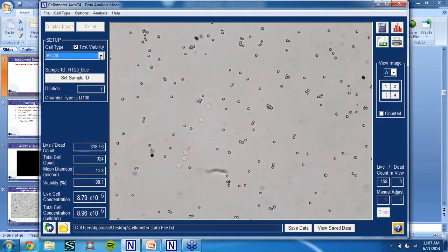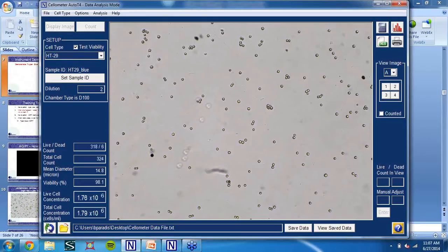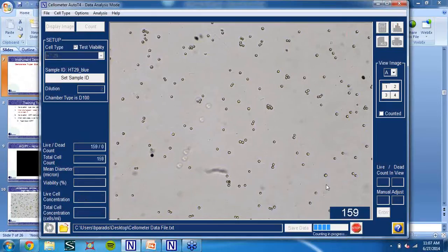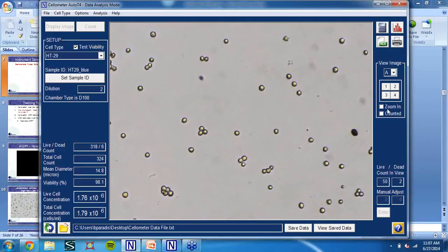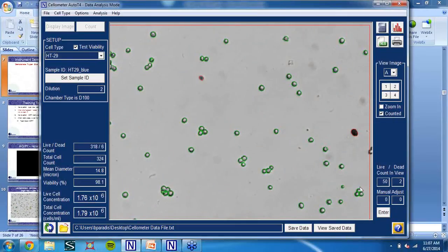Really quickly, we select our HT29 cell type and make sure that test viability is checked. Our dilution factor is two since we diluted one-to-one with our cell sample in Trypan Blue. So I'm going to quickly recount this image — you can see the software counting. Now that it's finished, let's zoom in to get a better look. We can check the counted box, and you can see that the clusters of cells are declustered, giving you an accurate measurement of live cells that are somewhat clumpy. Dead cells are outlined in red, indicating they are in fact dead.